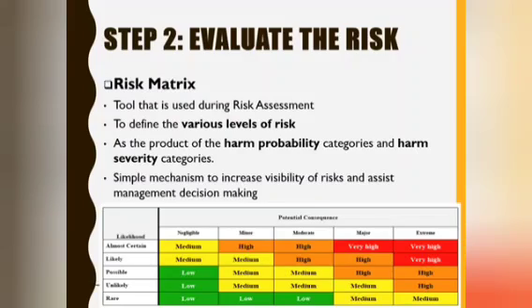Step 2. Evaluate the risk using a risk matrix.